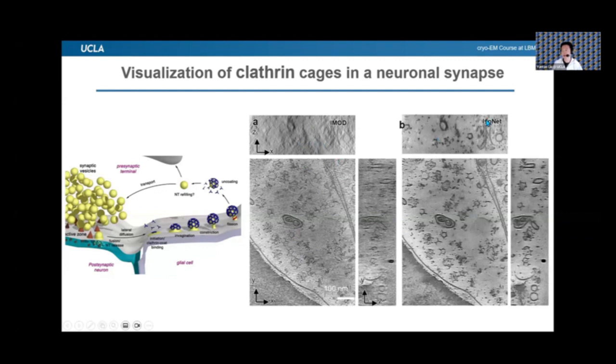After doing IsoNet, on the z-axis it is much more clear. This pentagon shape here is very difficult to recognize before, but it is there, and it is much easier to recognize now. This is the effect in another tomogram of a synapse.